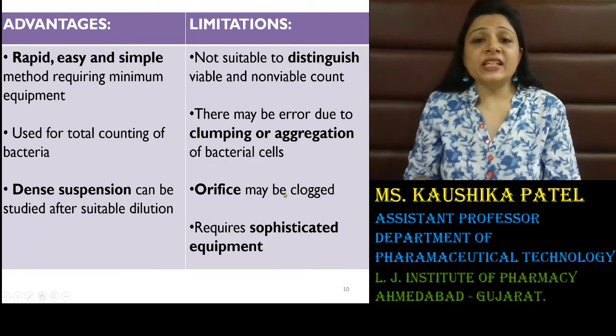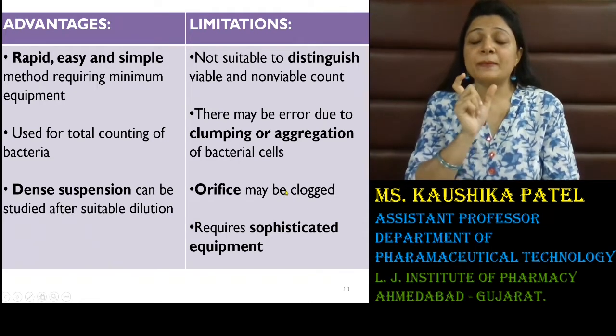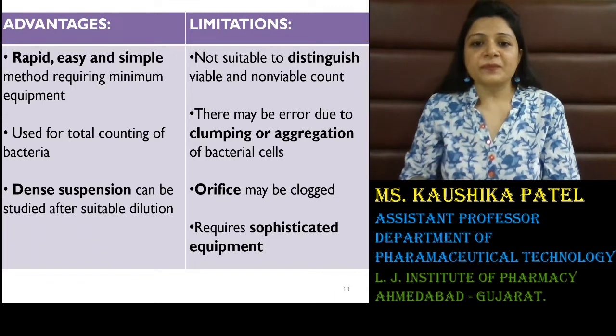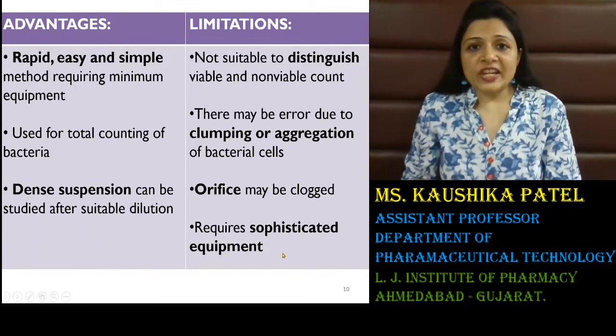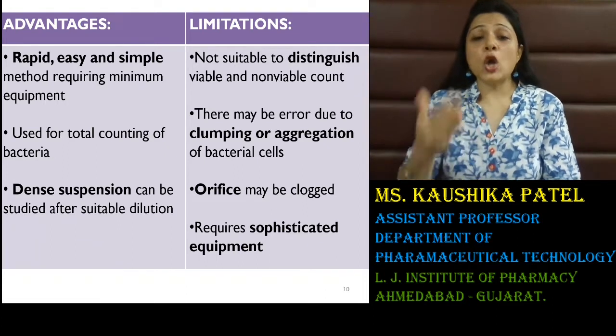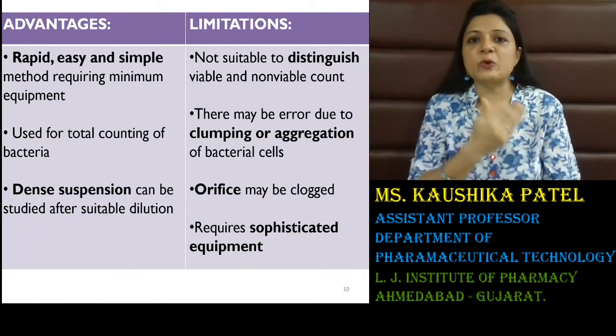You have to maintain the device properly because the orifice may get clogged. You have to clear it from time to time. It will require a sophisticated equipment, so the processing of the sample will be costly compared to that of microscopic method.